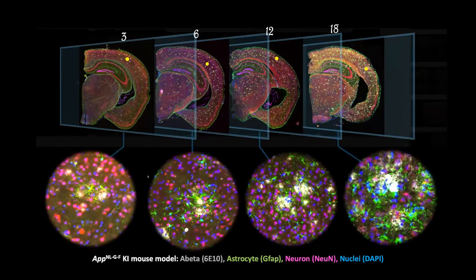Zooming in, you can already see the whitish amyloid plaque at a very early stage, which can already induce GFAP-positive astrocytes, like an envelope around the plaque. This is specific to a particular microenvironment, but not really far from the plaque. And this cellular response gets more severe during disease progression, together with the amyloid plaque.